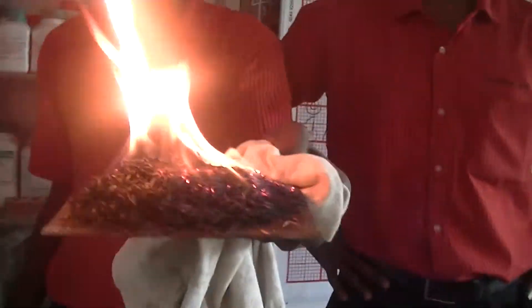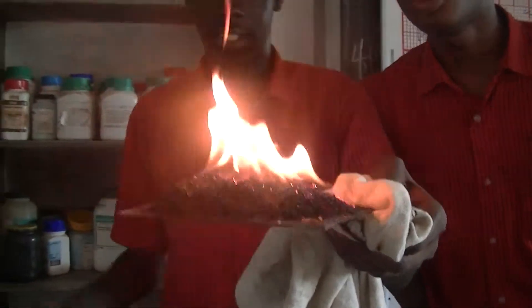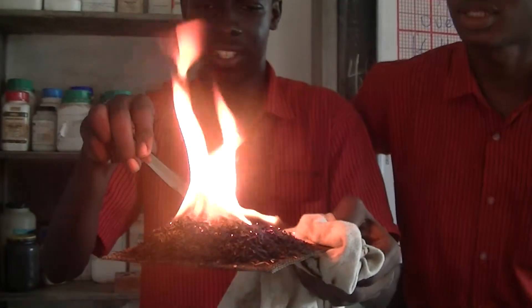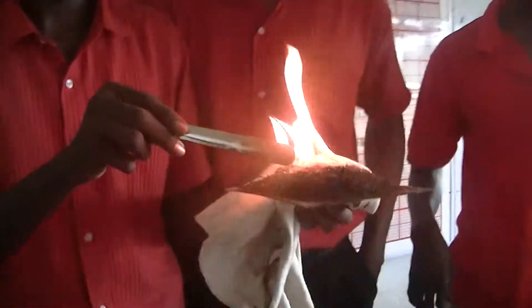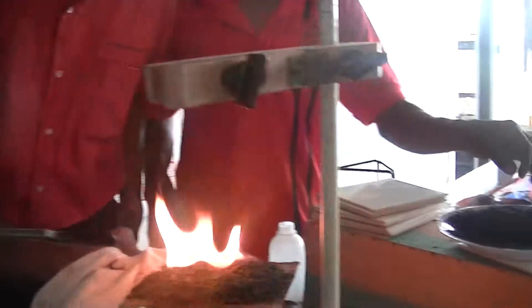As you can see here, our colleague is making best use of the resources, making sure that the rice is really adequately burnt so it could serve in the best process.